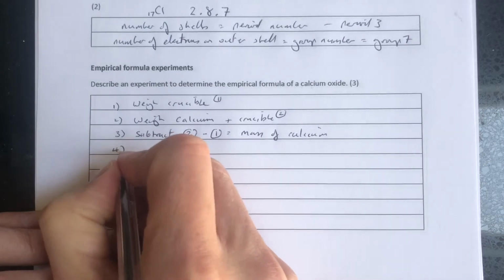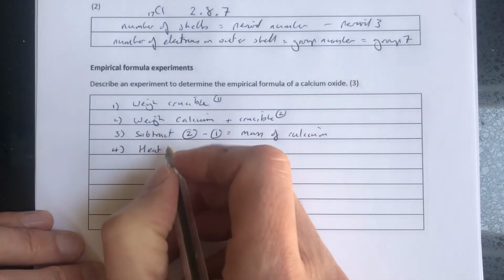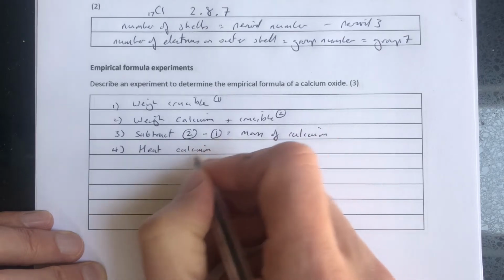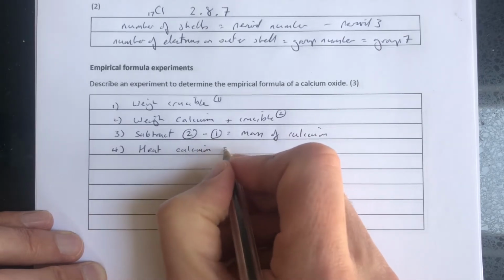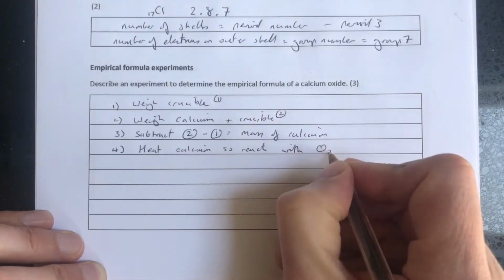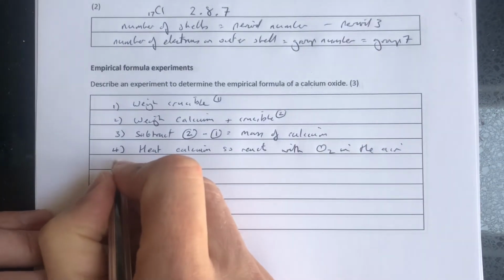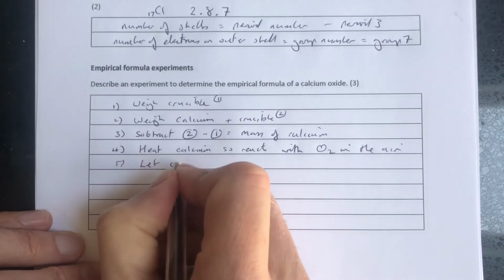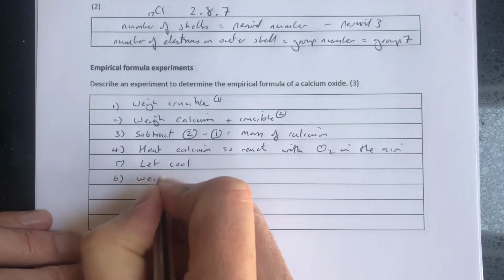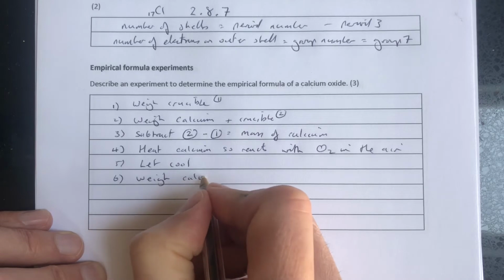Okay, after we've done that, we're going to heat, because we need to react the calcium with oxygen. And we're going to do that by heating the calcium in the crucible. So we heat the crucible with the calcium in it, so it reacts with oxygen in the air. Okay, after we've done that, it's important now we let that cool, because otherwise that could burn us. And then we're going to weigh the calcium oxide. So now it's reacted with oxygen, it's now calcium oxide. Weigh the calcium oxide.